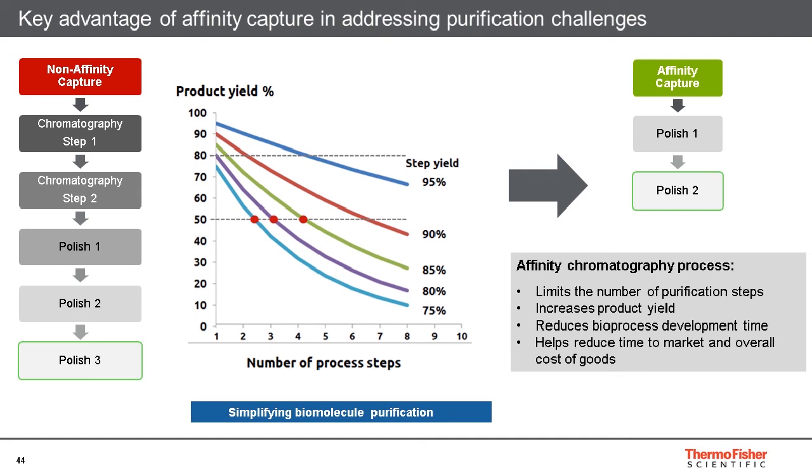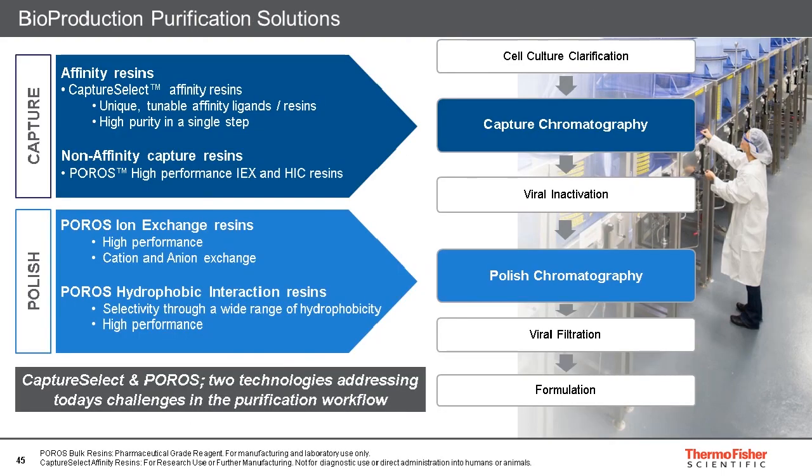So in the first case, the human situation, rather than having to use several ion exchange or several other steps, one after the other, one of the smarter ways can be to introduce affinity early. Affinity early puts you back in the situation where your colleagues in monoclonal antibodies are, with just protein A and limited polishing.